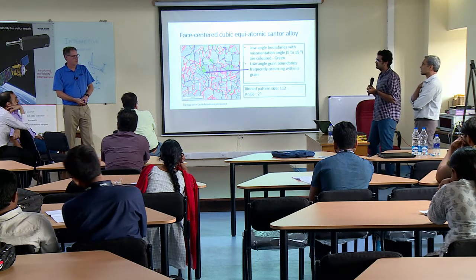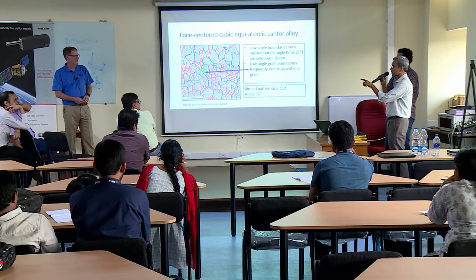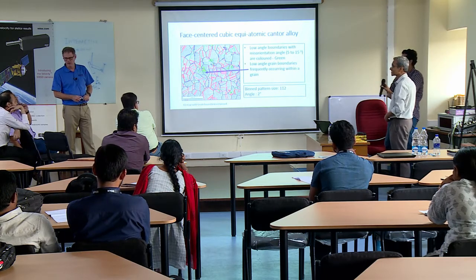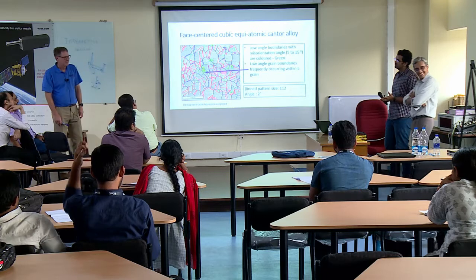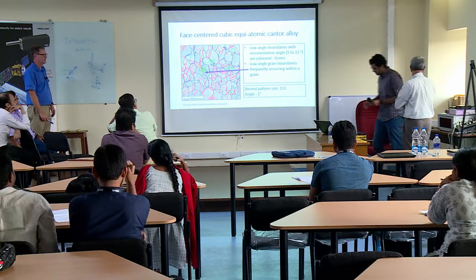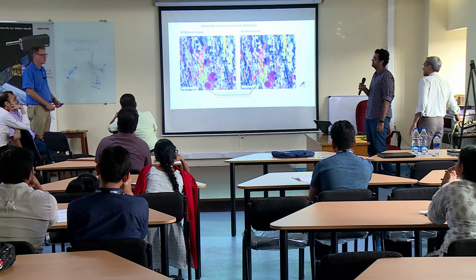Yeah, I'm working on this problem. It's very strange because I'll take a data set like this. So if you run the same scan and reindex it again, that thing will appear in a different position. Yes. Yeah, I'll retune it and then it will work. And I don't understand why. I think I have a rounding error is my guess, but I don't know what it is. Yeah, that's an idea. Is try a different working distance possibly too.